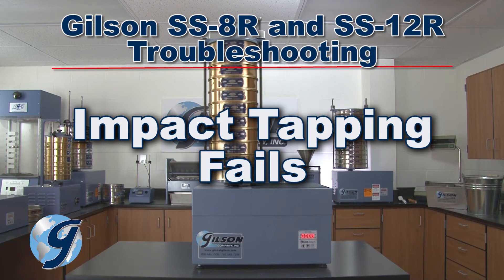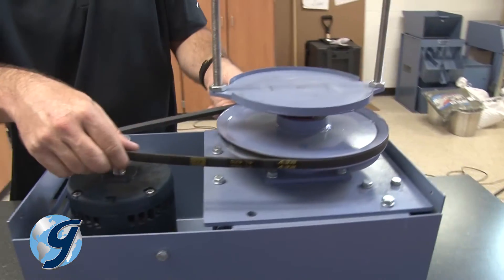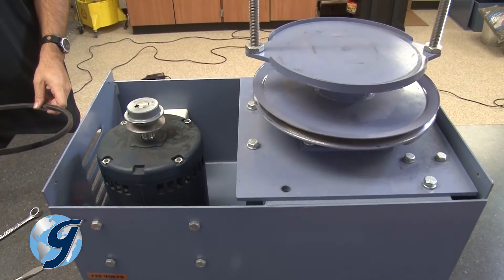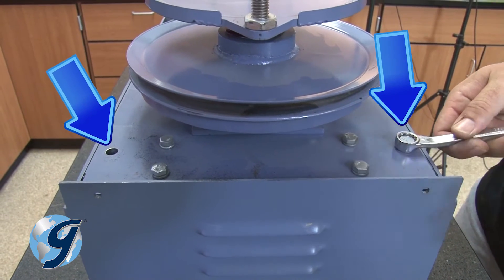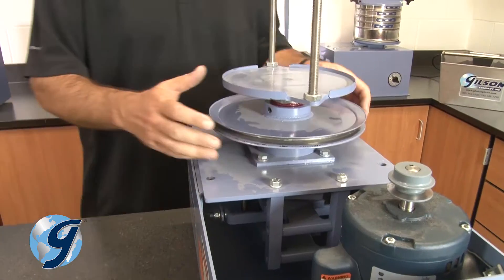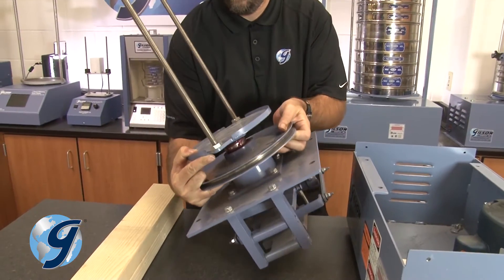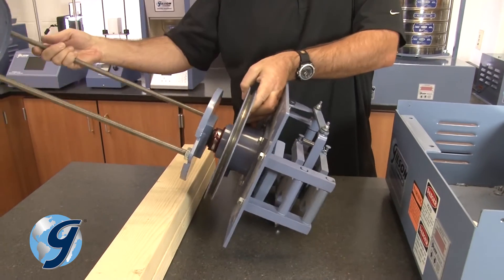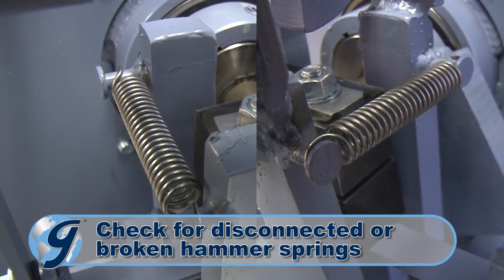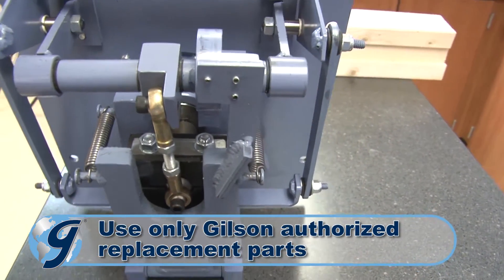If the unit runs but the impact tapping fails, you need to check the hammer springs. First, remove the drive belt from both pulleys. Note the orientation of the assembly for reinsertion later. Now remove the two remaining mounting cap screws from the mounting plate. Next, lift the entire assembly out of the case and set it on its side. Take care not to put too much weight on the rods. Now check the hammer springs to make sure they are not disconnected or broken. Reconnect or replace the hammer springs as needed.